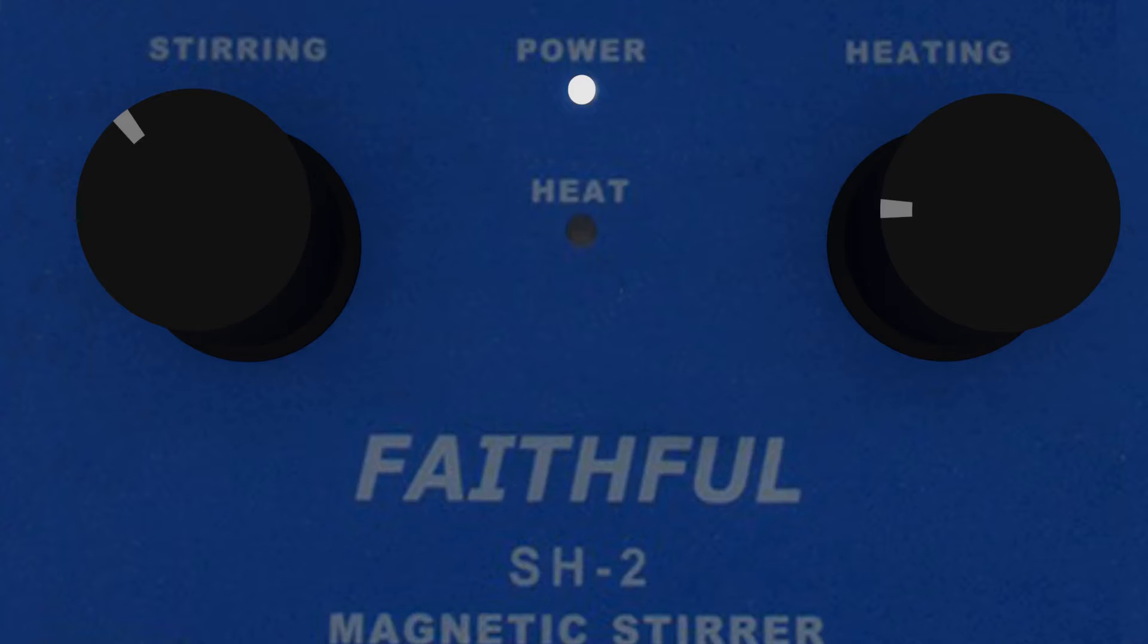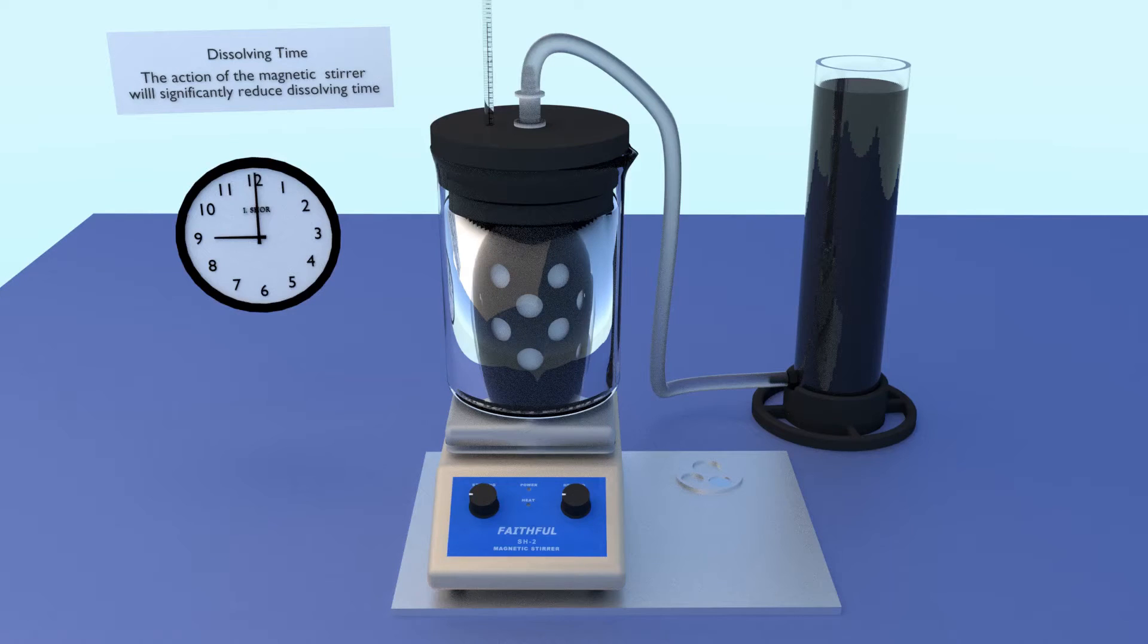If refining platinum or most other platinum group metals, you may want to turn on the heat to speed dissolution. However, palladium does not require heat. Typical dissolving time is about 1 hour.